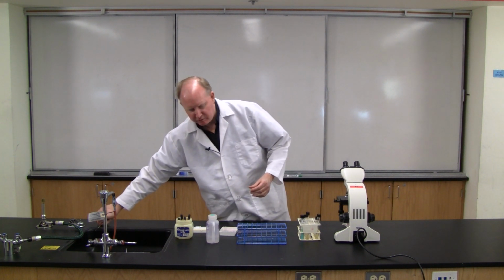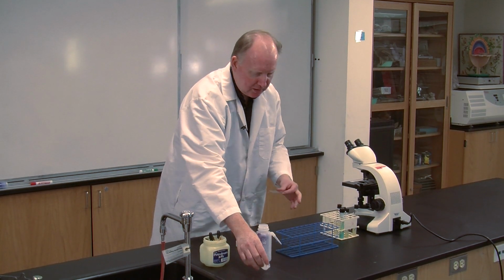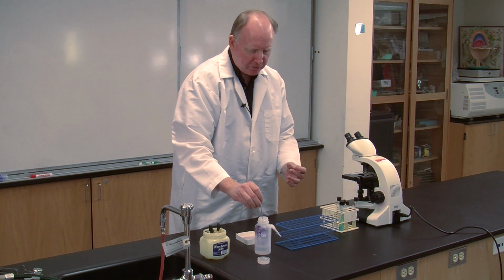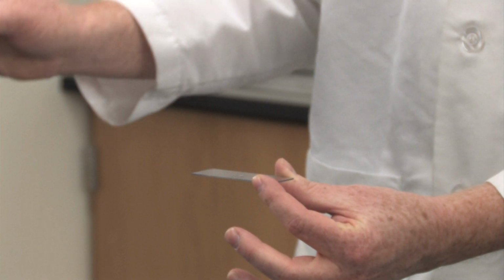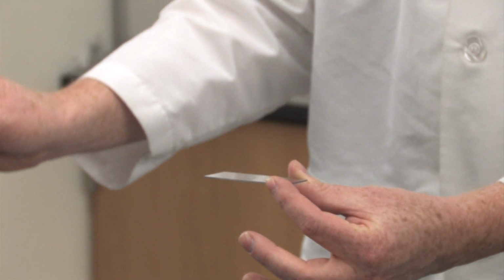to have to add a little bit of liquid. So we're just going to get some water using our inoculating loop. I usually recommend about 3 loopfuls is about the right amount. So 3 loopfuls of water. Doesn't have to be sterile. Right in the middle of the slide.